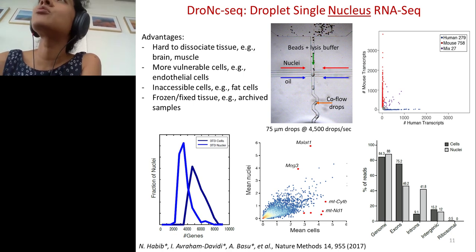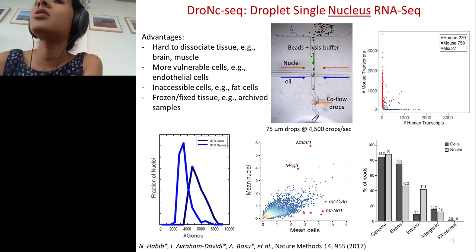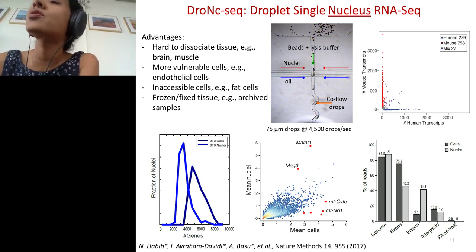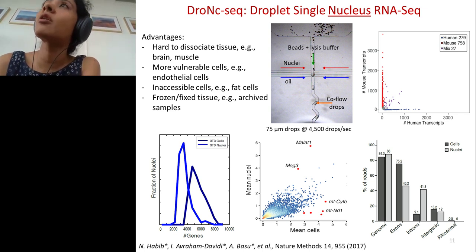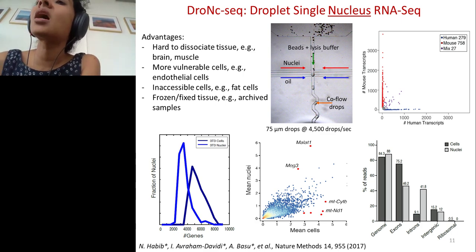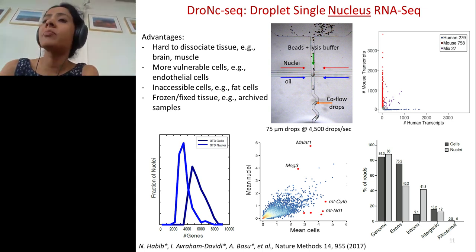So it's very difficult to make a clean single cell suspension. So the choice was to work with the single nuclei. The nuclei is much more intact as RNA. It is the RNA that got recently transcribed and is in the process of going out from the nucleus to the cytoplasm. And it is similar, it is representative of the cell, but not quite the same.